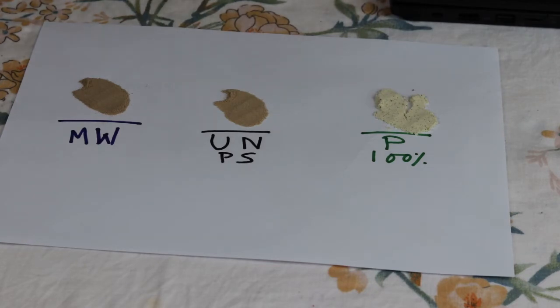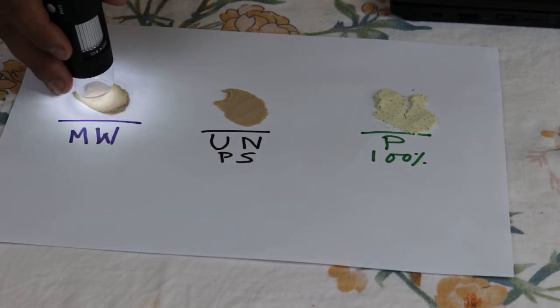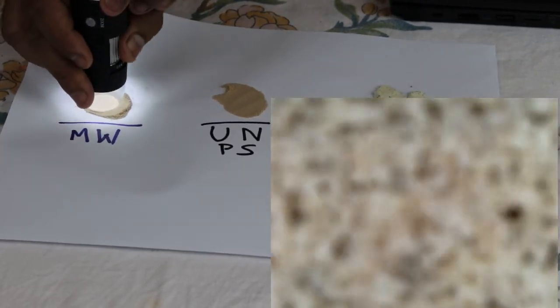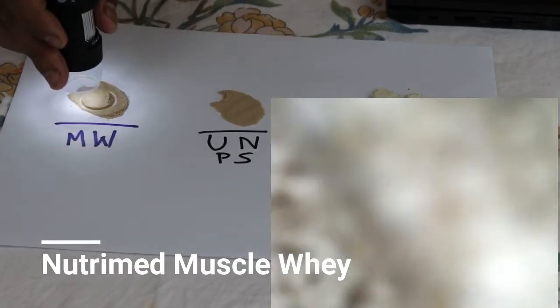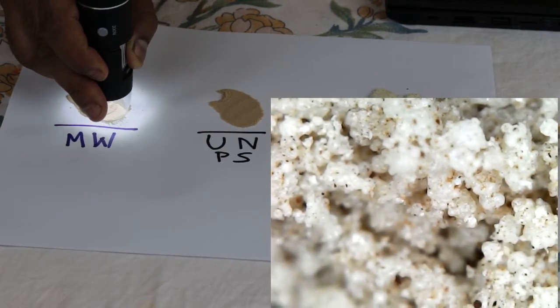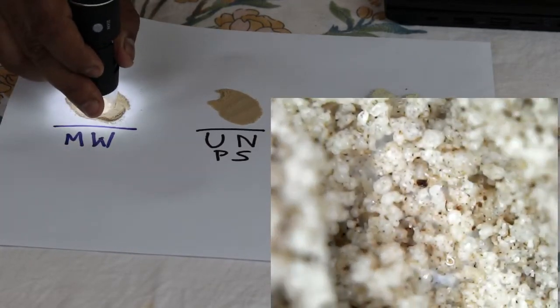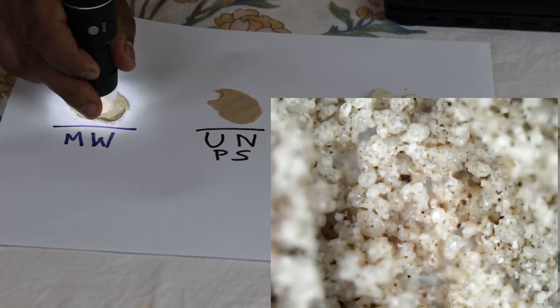All right, let's start with our microscopic test, starting off with the very first, Muscle Whey, and we're recording. Yes, so what do you see? Nothing? Oh, okay, now you see. We've done the Muscle Whey microscopic test some time back, when we did the review, I guess, in an initial microscopic test video. There's not much to see actually. There's no binder or anything. What you've got is a bunch of cocoa powder lying around, and some of those tiny little crystals.